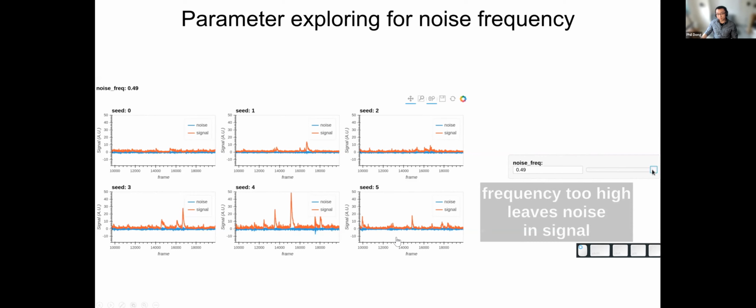We want to avoid both too low and too high, and choose some value in between. This visualization helps you choose a proper cutoff frequency, which is not only used for this refine step, but is also critical for a lot of other steps later in the pipeline.